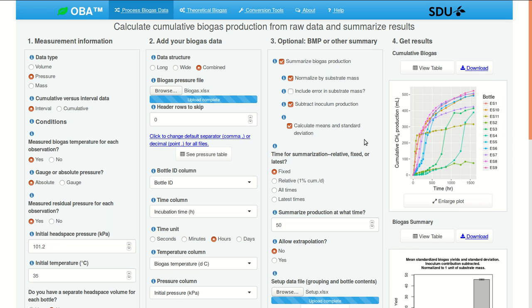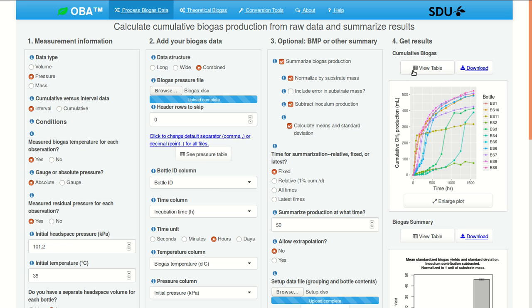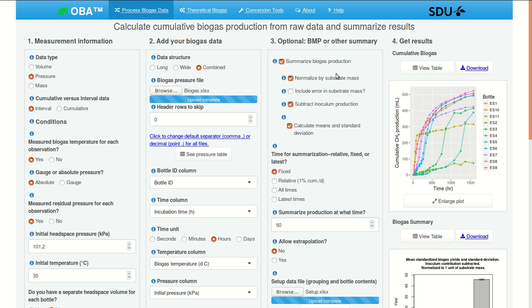There are a couple different options, a couple additional options for summarization time. We could use a relative option where OBA evaluates methane production rates and selects a time where production rate has dropped below 1% per day of cumulative values. In all of these cases, we can view the data with the view table button and download results as a CSV file.